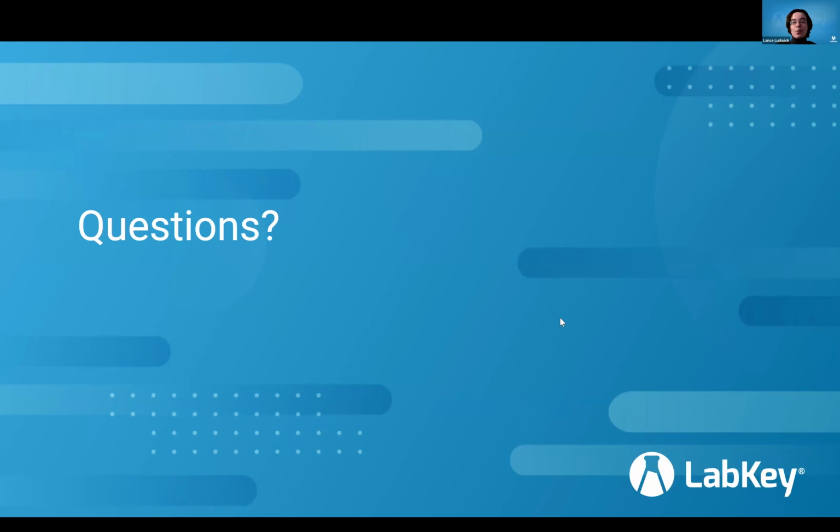And that's where we really support you. We can get your historical data into Sample Manager, so you don't really have to worry about doing that cleanup. We can help you do it. And we also provide training on Sample Manager, to make sure that you know exactly how to use the system. And we really help you get fully onboarded in the system. And after that implementation process, we make sure that we're always here for your support. So if you do need additional training, or if any issues come up, we're always here to help you out.